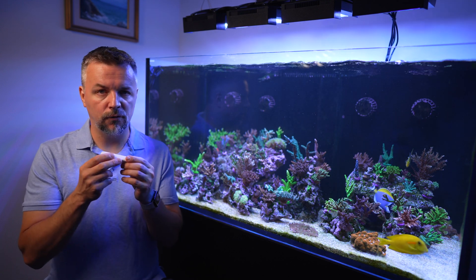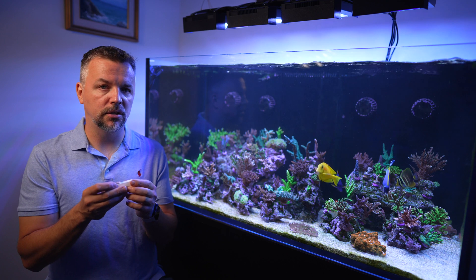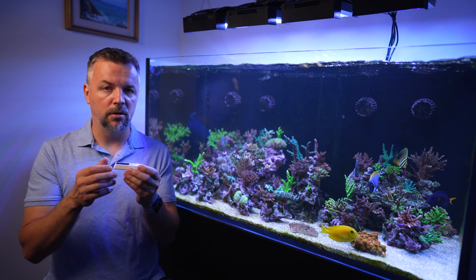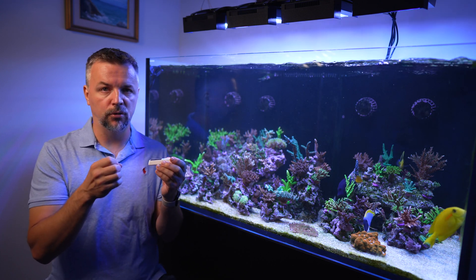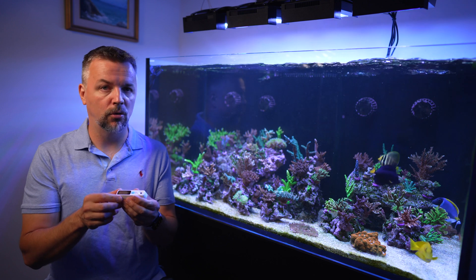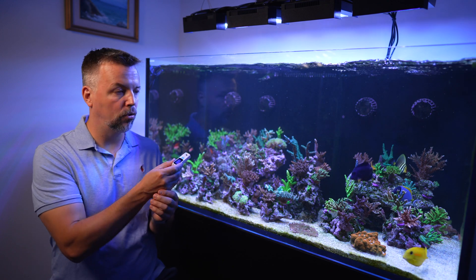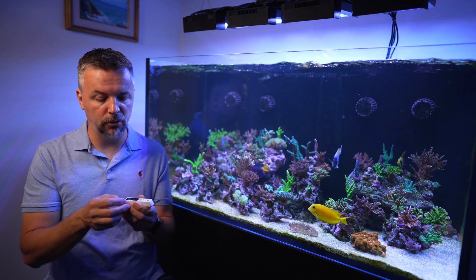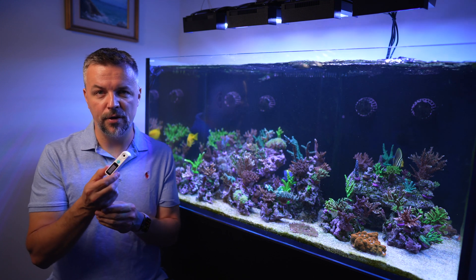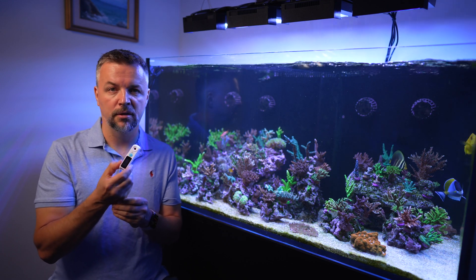Unfortunately this is not designed around our reefing hobby. This particular unit is probably more about measuring Brix — if you are making espresso, working with vinegar, beer, or canned fruit, this is probably what you want. However, I think you can easily use it for salinity. It does have a measurement called 'salt' but it gives you a percentage, and we're going to see how that compares to the HANA and Milwaukee refractometers.